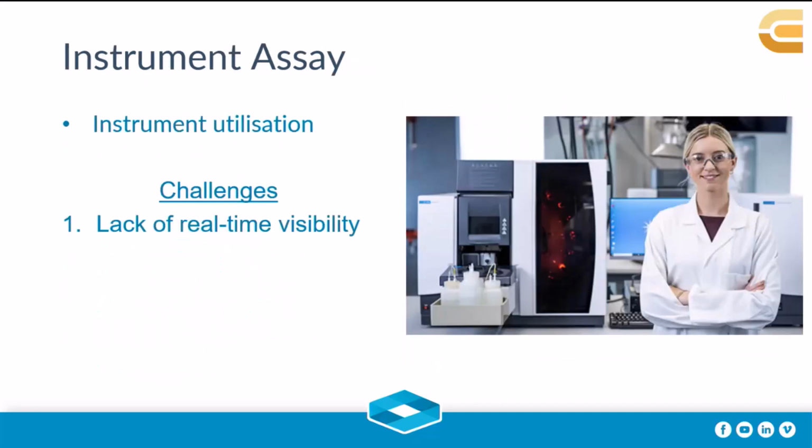Once sample preparation is finished, the samples are then moved into the analytical laboratory, where the samples are generally batched, weighed, digested up to be read onto instruments. So, maximizing instrument utilization can be challenging when there's a large number of samples and limited instrument availability.